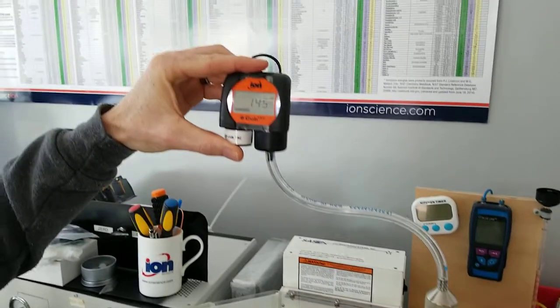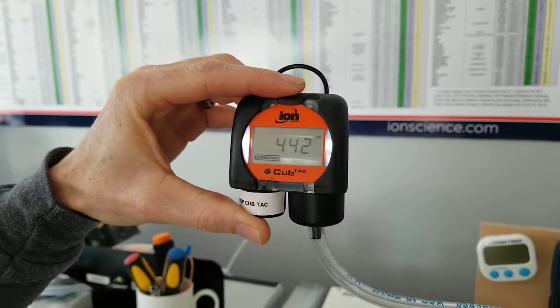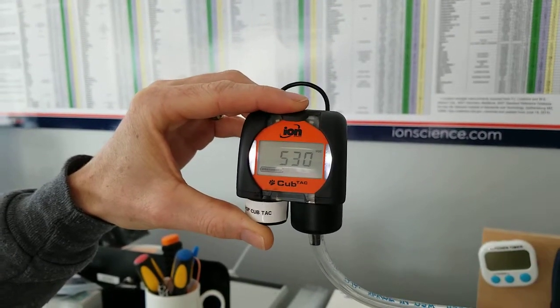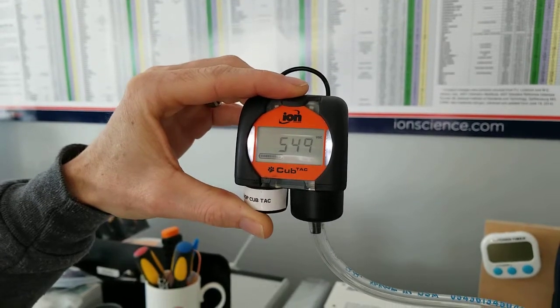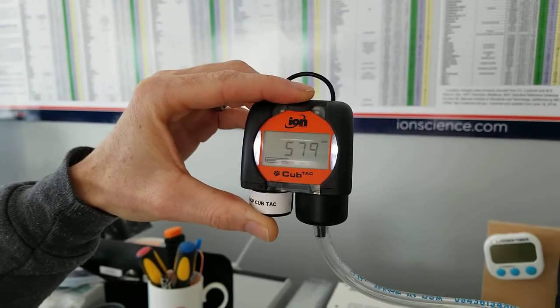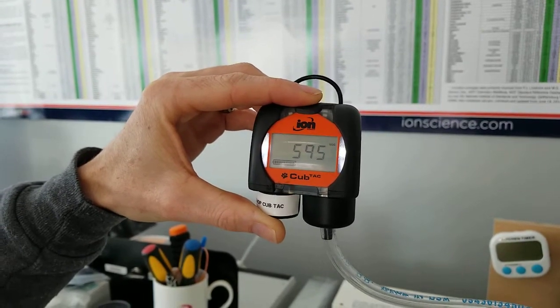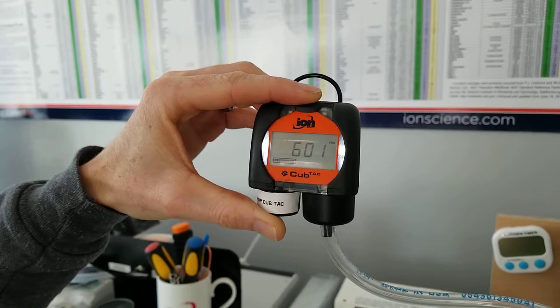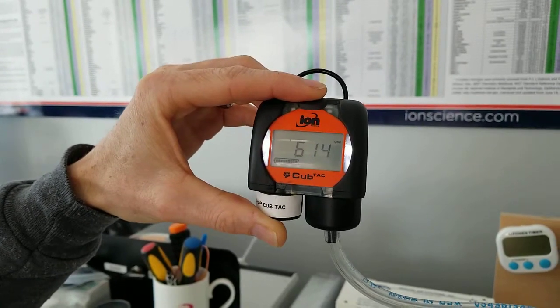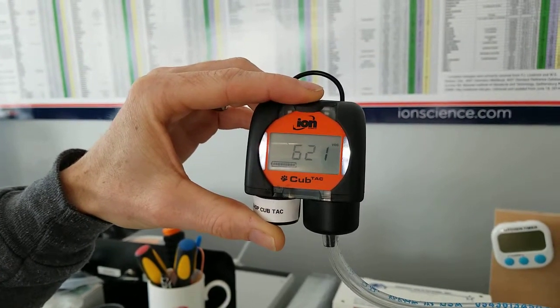At this point we put the instrument to our calibration gas. We're turning on the regulator and applying gas. We can see the signal starting to rise. We may need as much as 40 seconds — 30 seconds is probably enough for everything to stabilize. We keep watching the numbers go up; right now we're seeing changes of four or five at a time, then down to two or three.